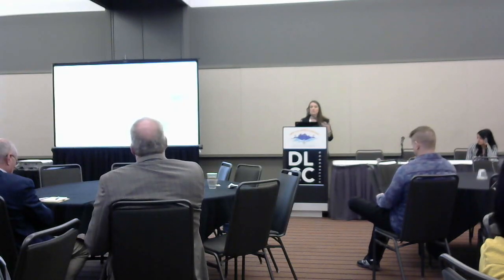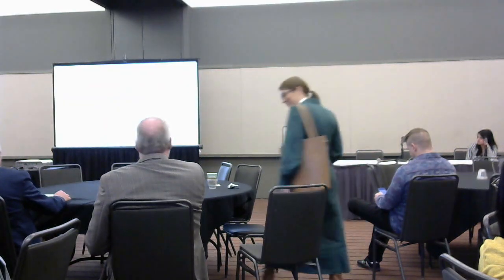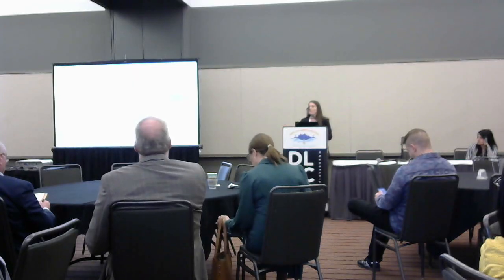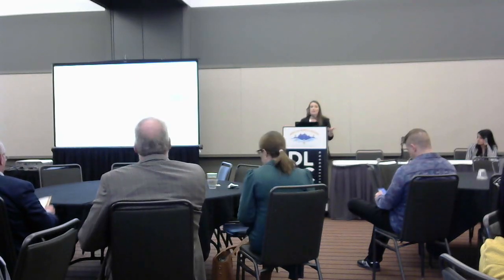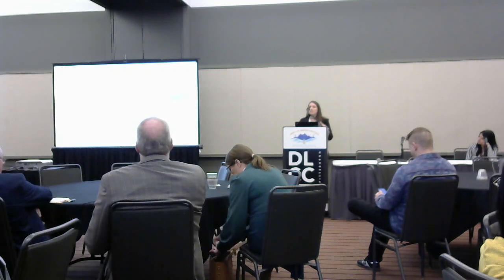And even when you are happy with your sample prep, happy with your microscopy, you may need to sit down and iterate on the actual analysis approaches that you're choosing. Even I can't suggest to a client right away, you should probably do these steps. Maybe I'll be right, maybe I'll be wrong. They still have to sit down and iterate through that process based on their unique data.